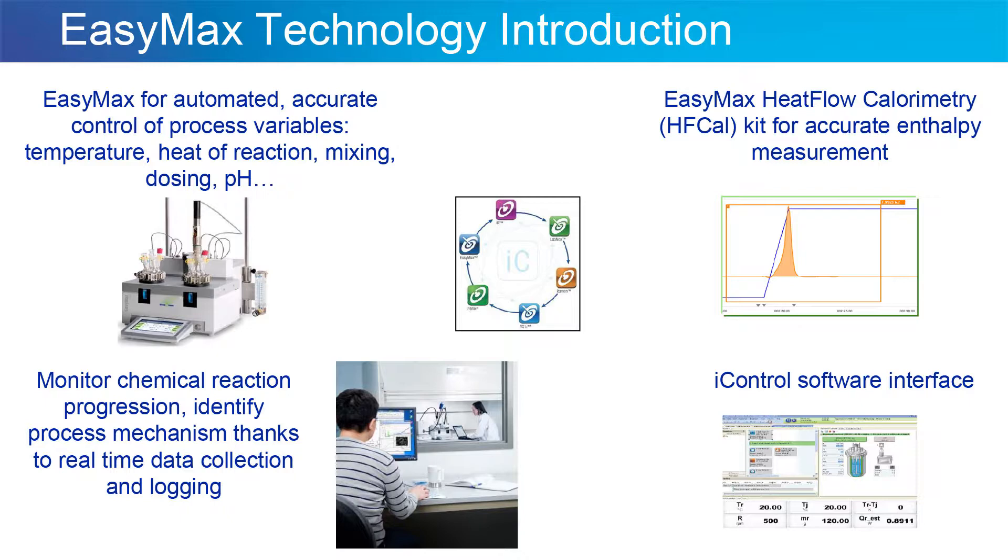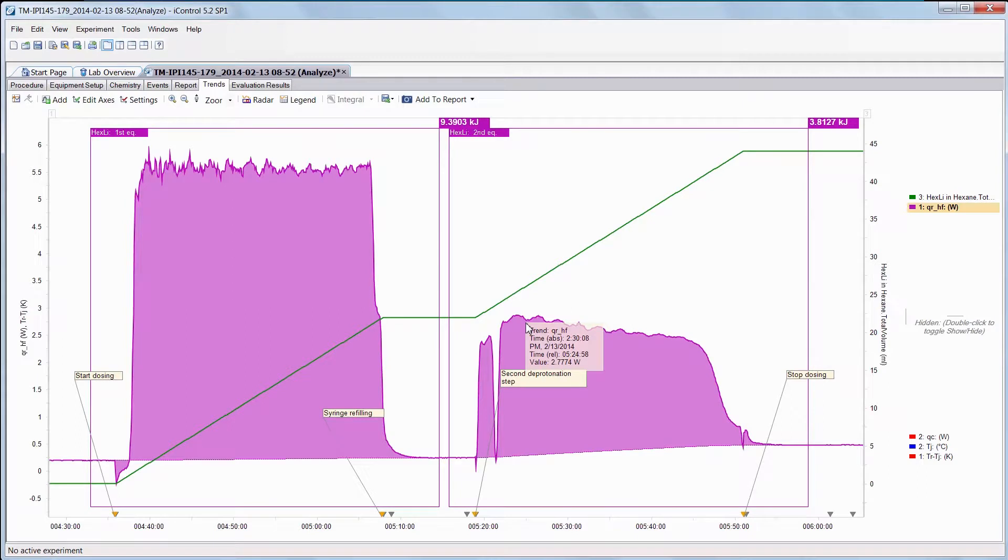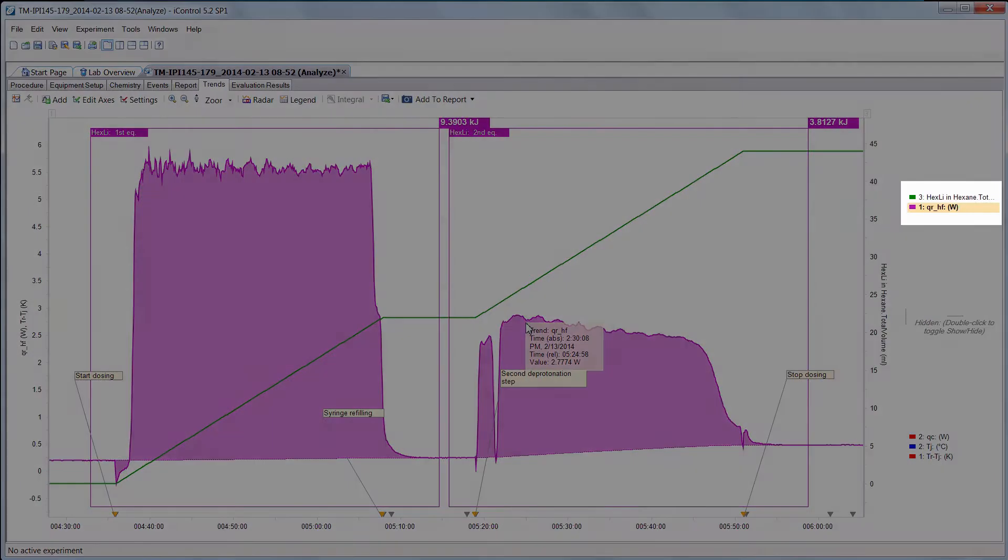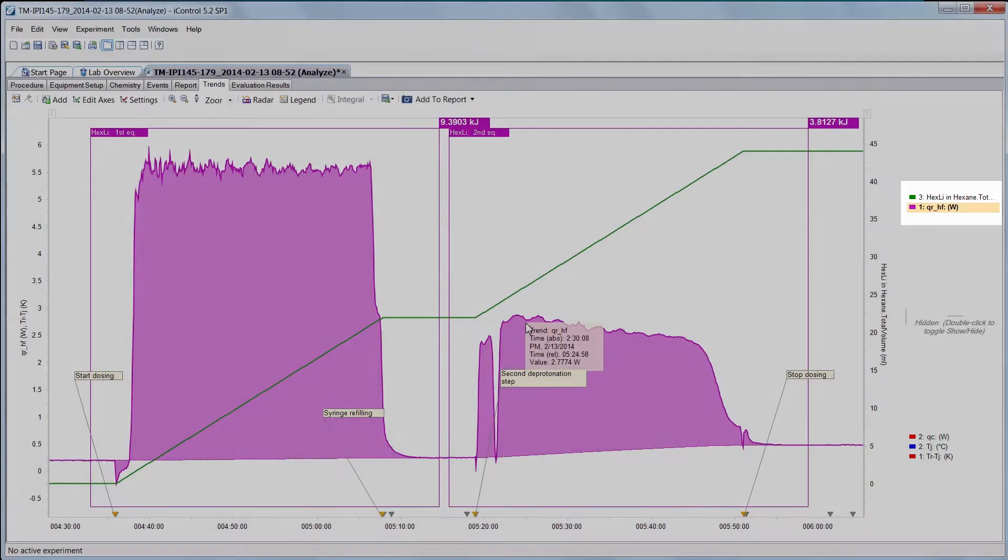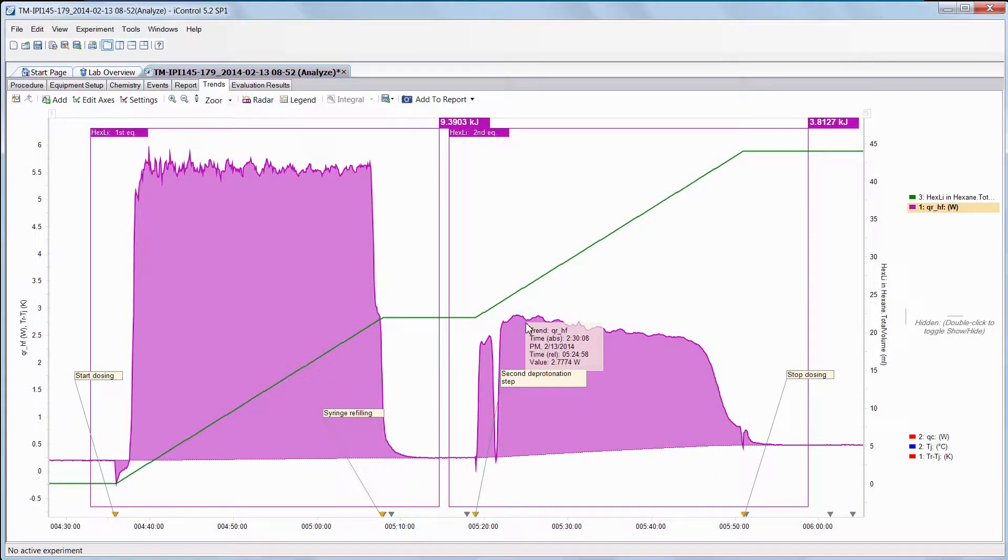Alright, now I'm going to switch to the iControl software page to show you how to interpret the results. So in purple you have the heat that you can read on the left axis. In green you have the dosing profile for the strong base hexylithium that you can read on the right side of the screen, and the volume goes from zero to about 45 milliliters of base to the addition mixture.